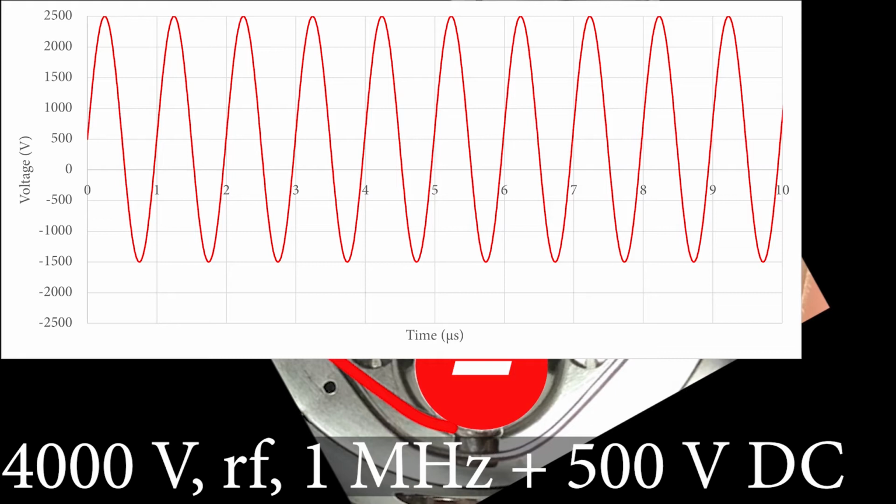Okay, so you're probably saying this is a lot of effort, this is a lot of work. It turns out, though, quadrupoles can be hard to understand. They're very hard to understand, but this is really easy relative to other mass analyzers to build and maintain, and it's cheap and simple in terms of the engineering and the science. Understanding it is not. But it is important that you have some understanding of it.